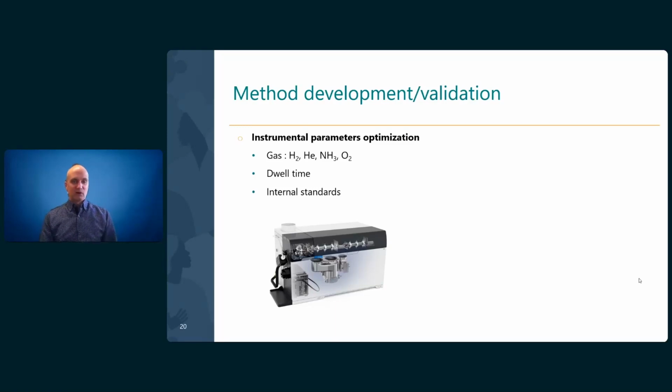For the method development, we went through first instrumental parameters optimization. For that, we played around the gases we can use. Either we tested hydrogen, helium, ammonia, oxygen, and so on. We played around the dwell time, the internal standards as well. So we tried to have the best match internal standards and analyte.